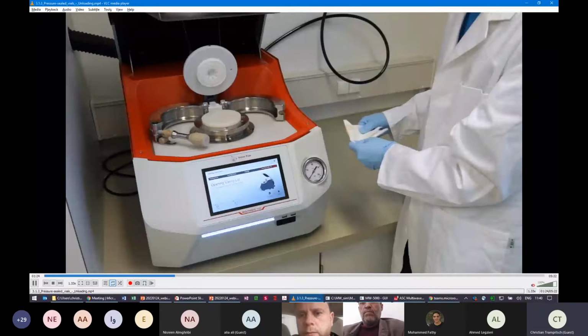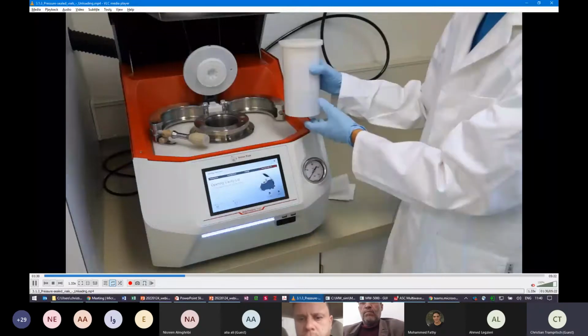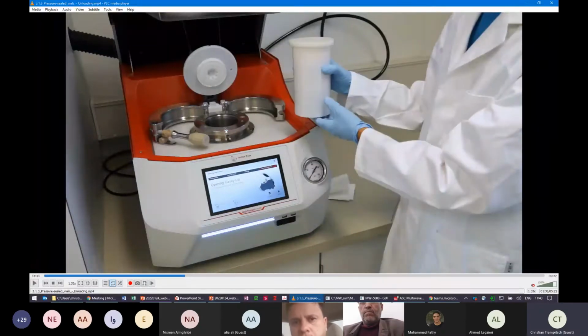We have a liner lift, and let me mention something. It looks like the liner shoots out like a rocket. That's not the case. Once the liner is on top, you see the grooves here. These grooves prevent the liner from just coming out. So it looks like I'm catching it, but it's definitely not the case. Just let me mention that.